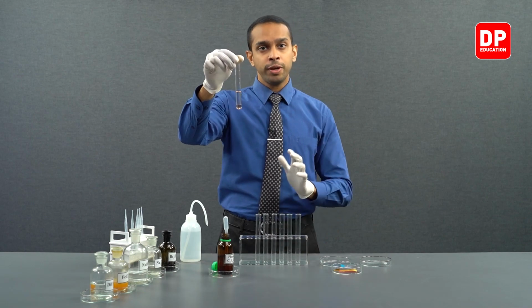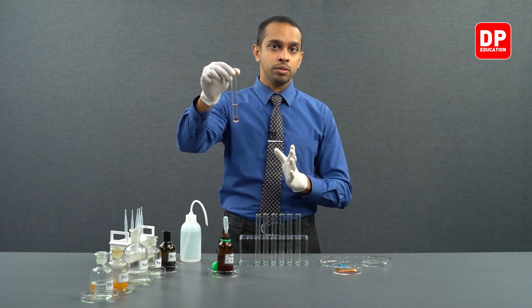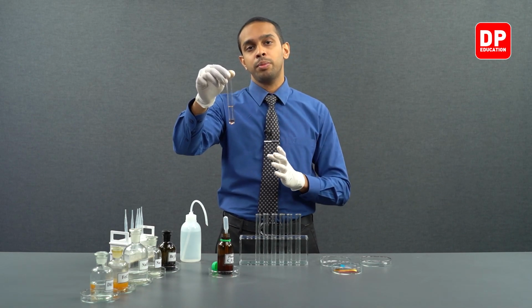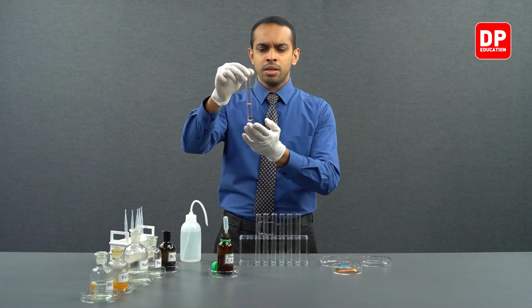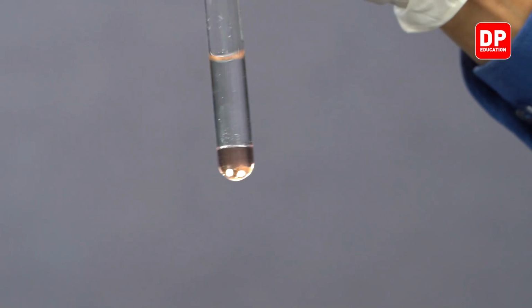However, phenol is known to be moderately soluble in water. 8.3 grams of phenol can dissolve in 100 milliliters of water. So this is a moderately soluble organic substance, which means some amount of this phenol will dissolve if I shake this test tube.